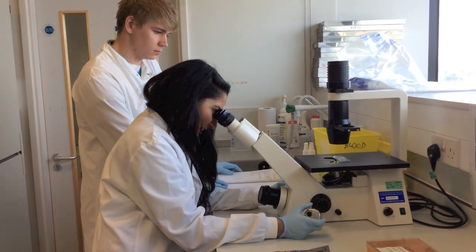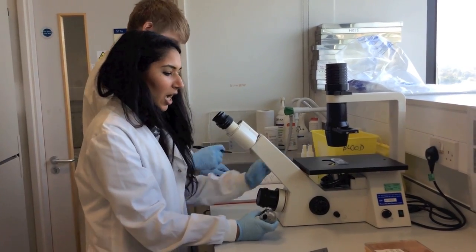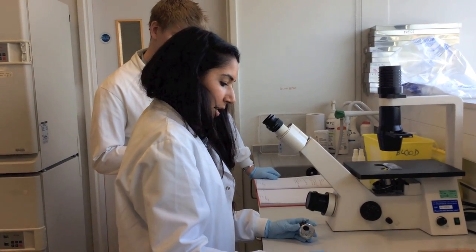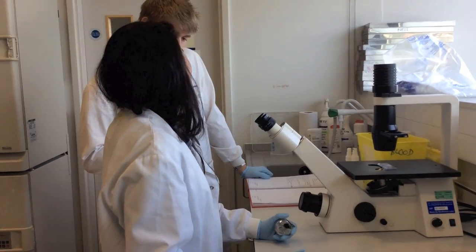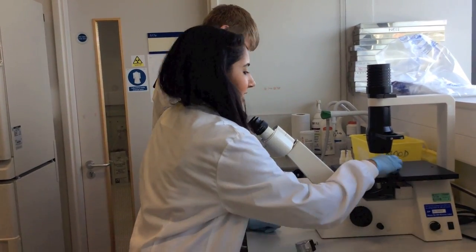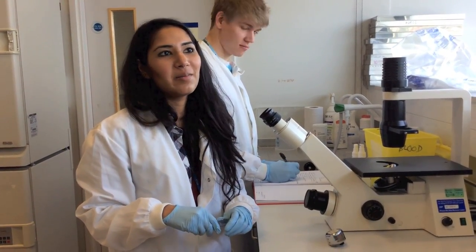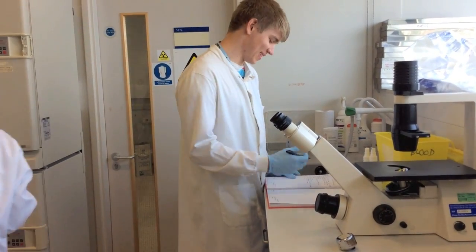So I'm just going to count the cells now. 101. 101 divided by 2 times 40. 20 million. Don't know. Never mind. Is that what you expected? Well, it's better than what we usually get. Okay. But we still haven't been to it next door. It's probably because you let me do it too.